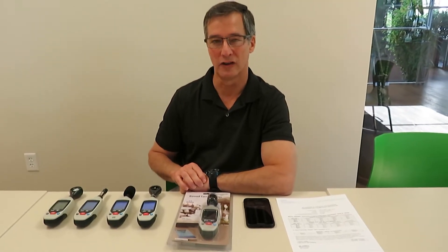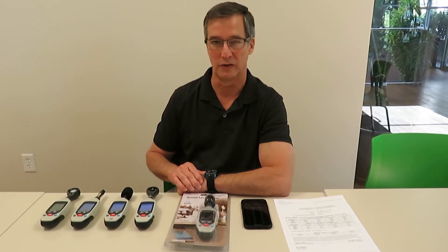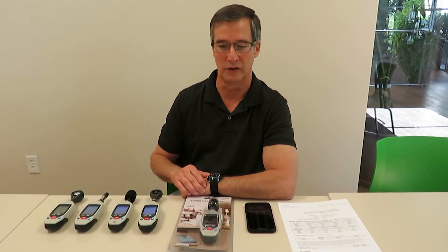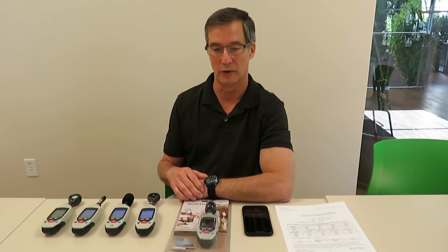Hello, we're at Spears Scientific where we're introducing four new environmental meters that use Bluetooth. These are in addition to the thermometers and hygrometers that we currently carry that use Bluetooth. These are reasonably priced meters with a lot of nice features, including the ability to wirelessly display and log data to an app.